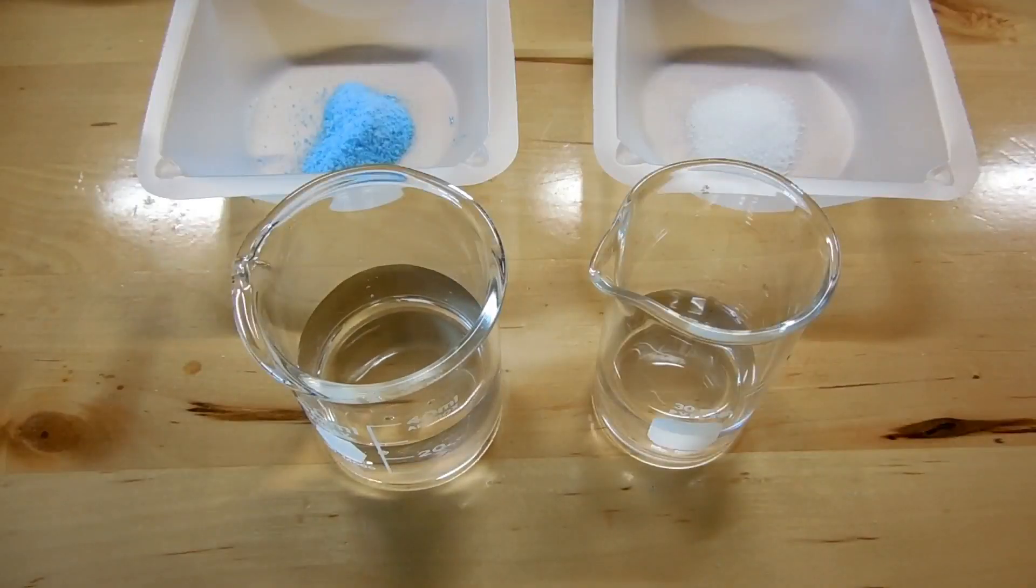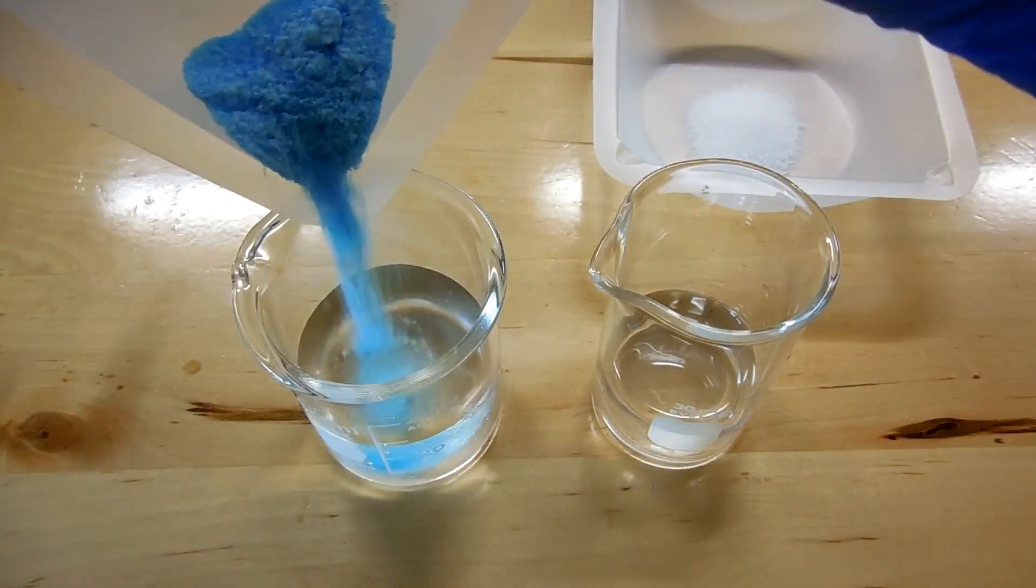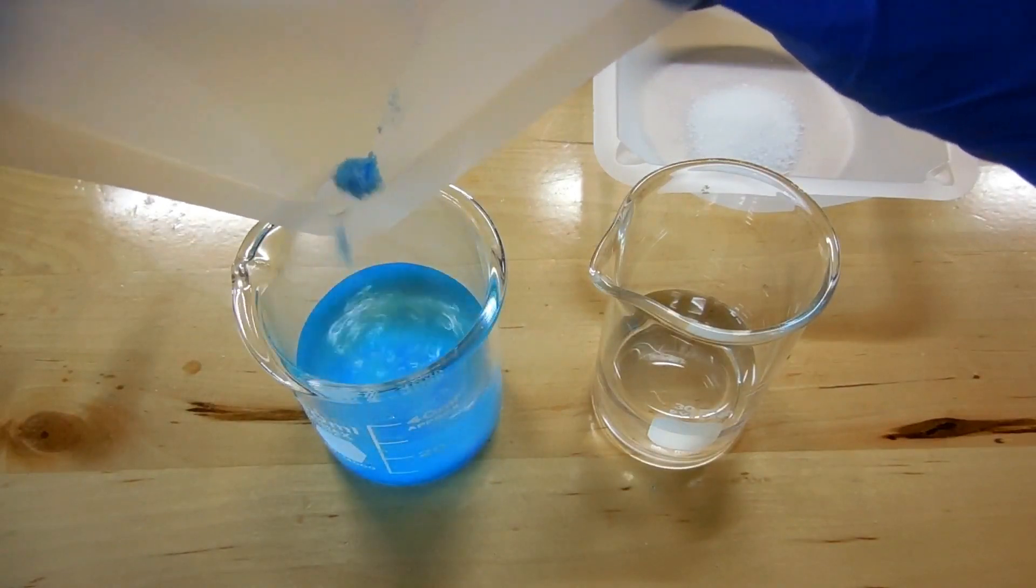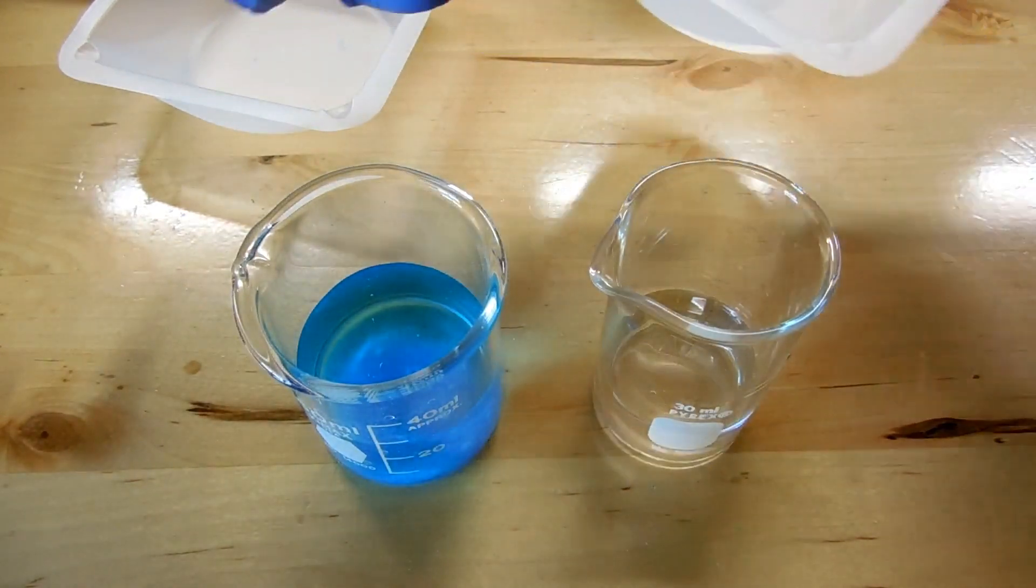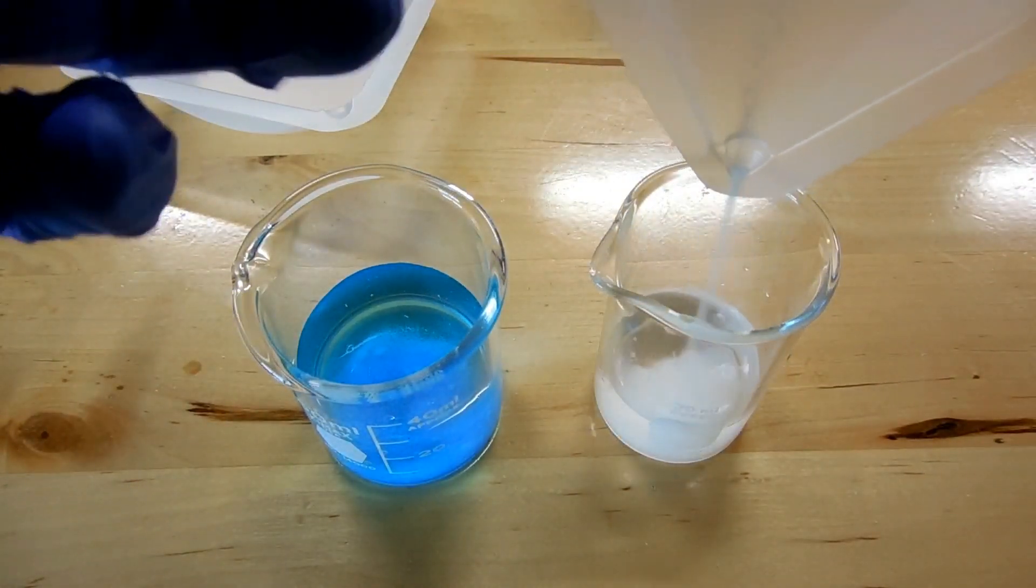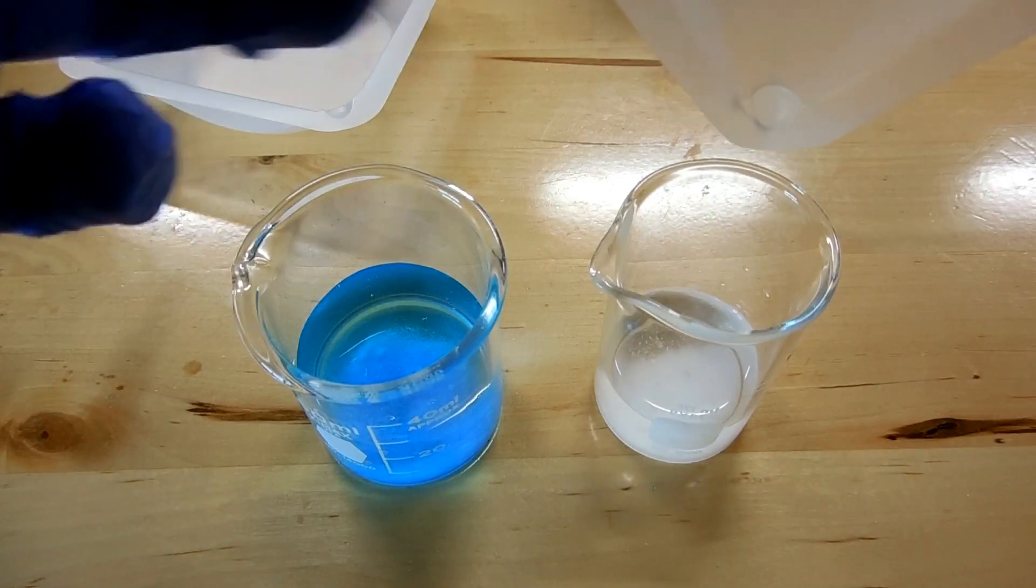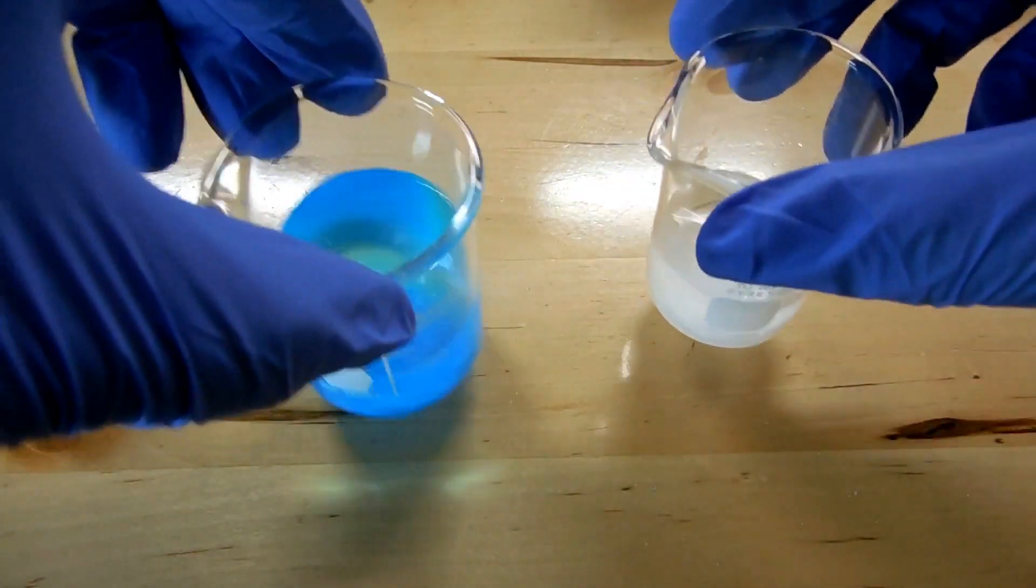Alright, now the solutions I'm going to make are 25 milliliters of distilled water for the copper sulfate, and 10 milliliters of distilled water for the sodium metabisulfite, and let's mix those up to dissolve them.